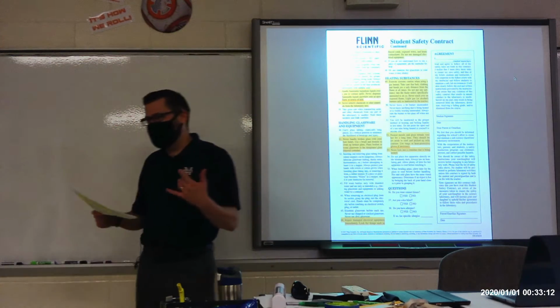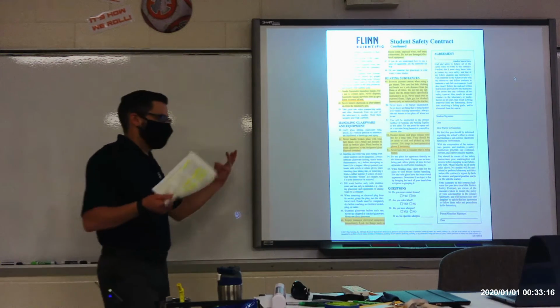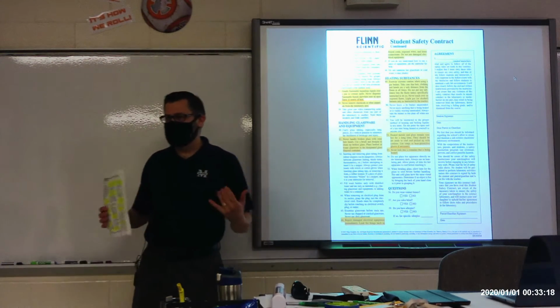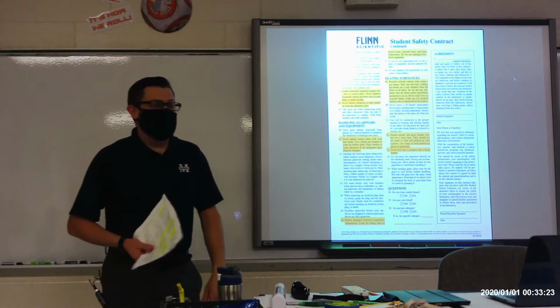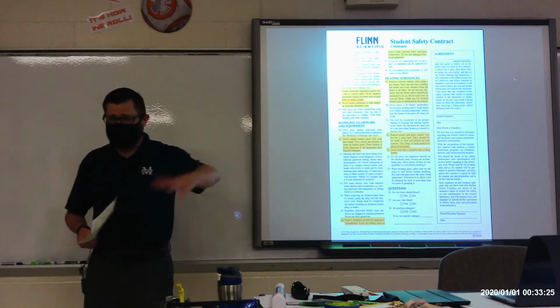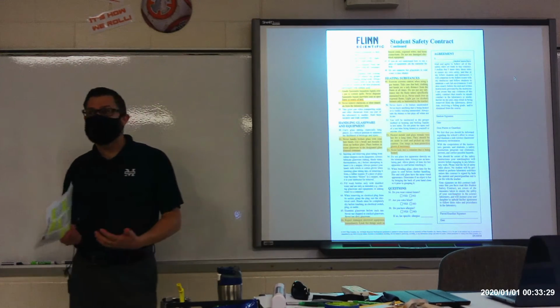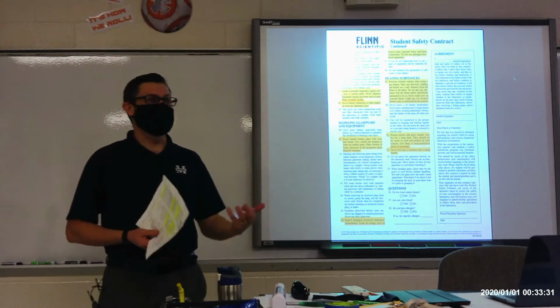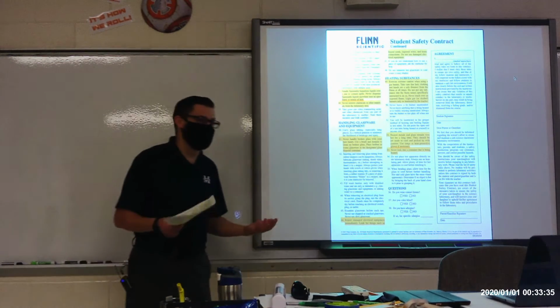Okay. Again, we don't have much occasion to use fire in this class, but who knows? Someday I might get creative and be like, hey, here's a really cool new experiment that we can do. Also, some people are not aware of how flammable some things can be. So even though we are not intentionally trying to make fire, you could potentially make fire if you're not careful.